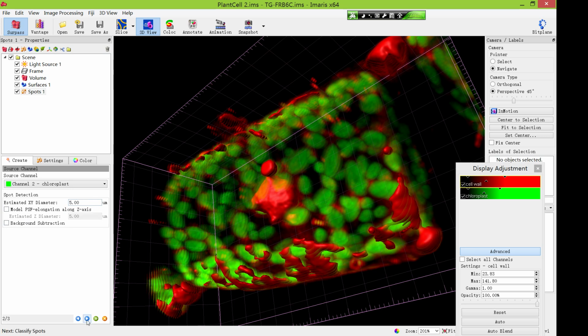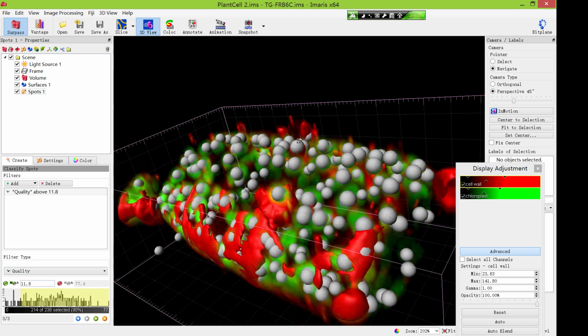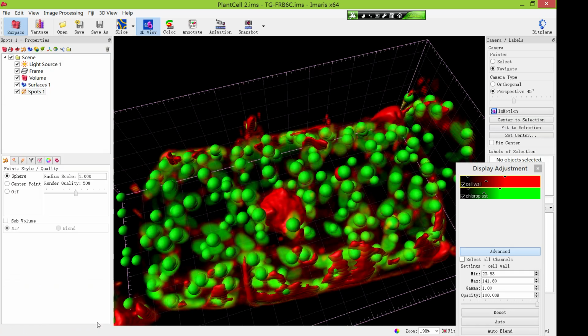So you click next, and the threshold is a quality threshold. It's 11.8. It reuses the demo one. If you think it is not appropriate, you may need to adjust it a little bit to make it appropriate. Then click all the way down. Okay, then you save.